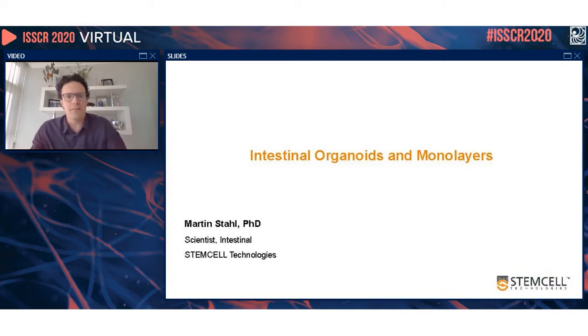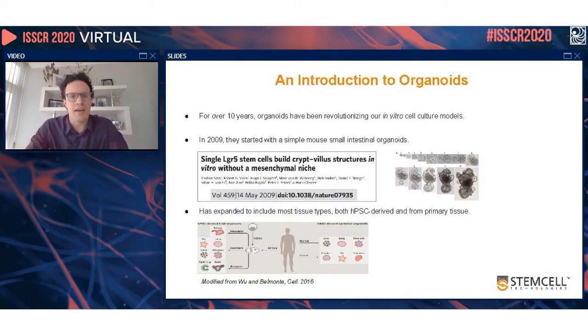I'm going to start today by speaking to you about intestinal organoids and monolayer cultures. So before I get into that, I'm going to talk to you a little bit about how far organoids have come over the last 10 years. They've been revolutionizing in vitro cell culture models since their introduction over 10 years ago, and it all started in 2009 with Toshiro Sato and Hans Clevers when they introduced the simple mouse small intestinal organoid model.